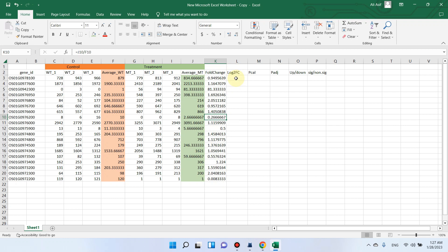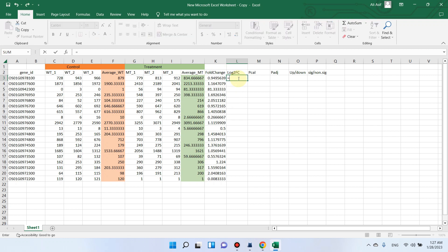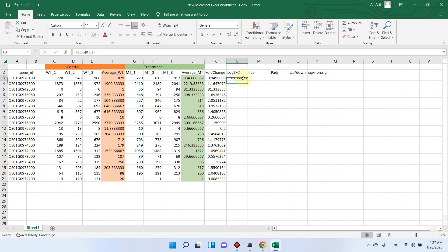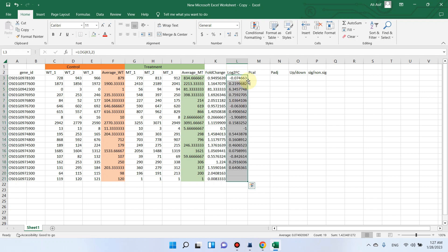Now we need to calculate the log2 FC value. We will start with the formula with an equal sign and write LOG, then double-click on it. First we select the FC value we just calculated, then we select the base value of 2. Now it will calculate the log2 FC value. Here you can see all the log2 FC values of our gene data.